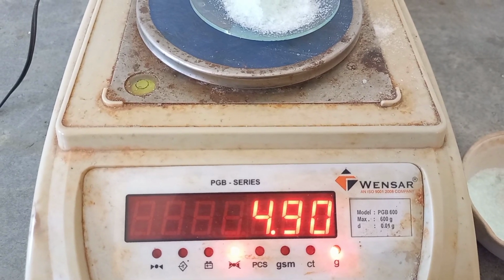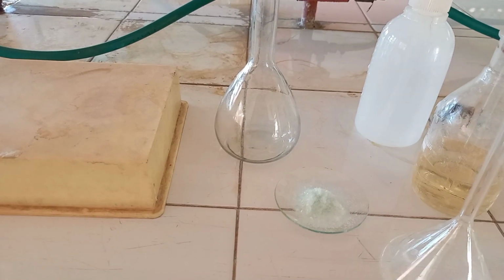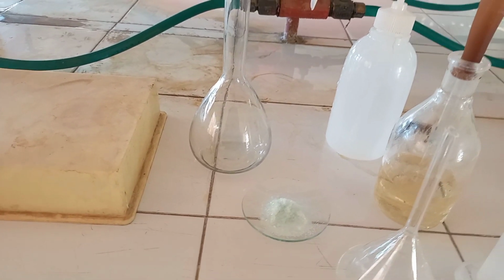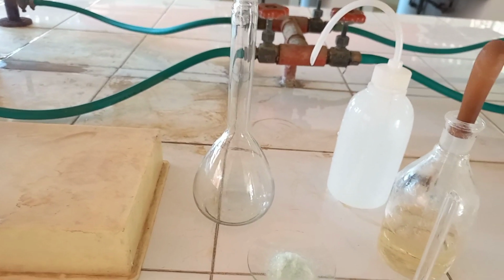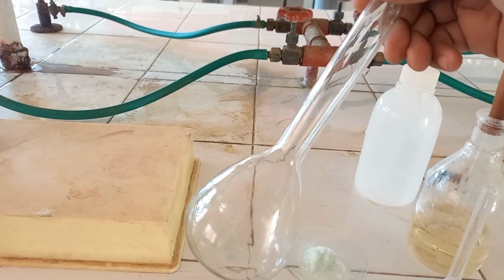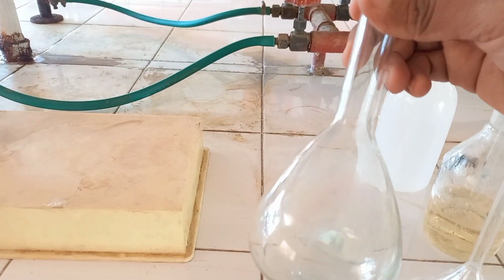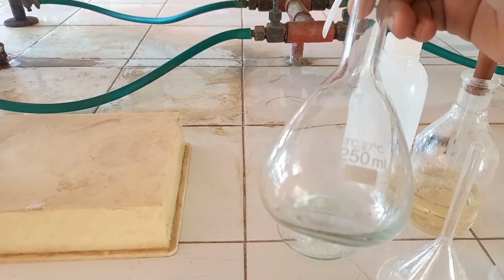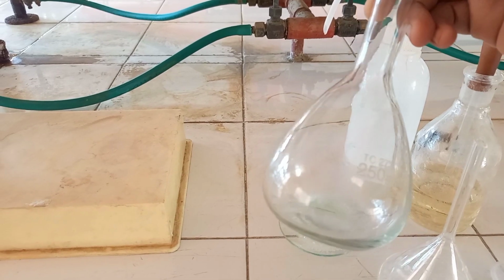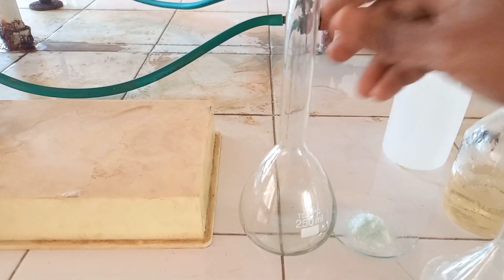So here we got the salt, and the weight of that salt is 4.9 gram. Now what you have to do, we will be preparing a standard solution. This is the standard flask which we are using for the preparation of the standard solution. Every flask has one mark, and this flask is of 250 ml. In the calculation also we took it as 250 ml.